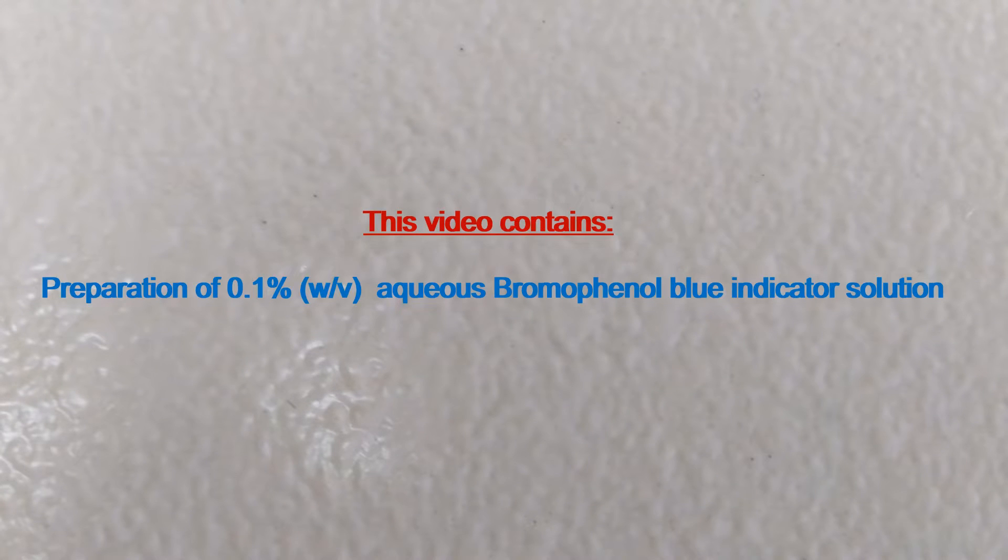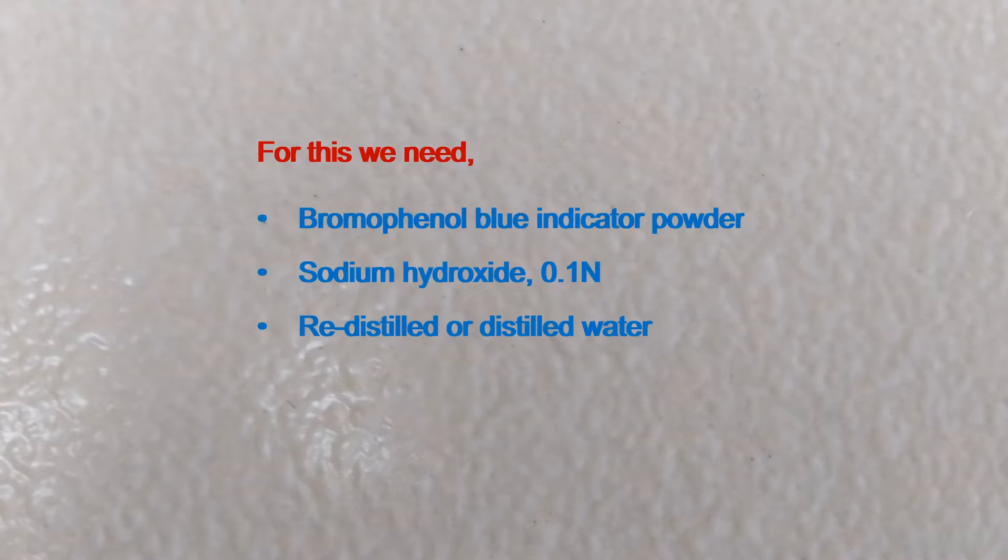This video contains preparation of 0.1% aqueous bromophenol blue indicator solution. For this we need bromophenol blue indicator powder, 0.1 N sodium hydroxide solution, and redistilled or distilled water.